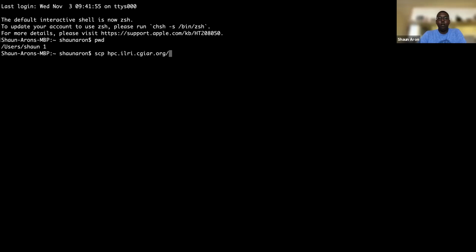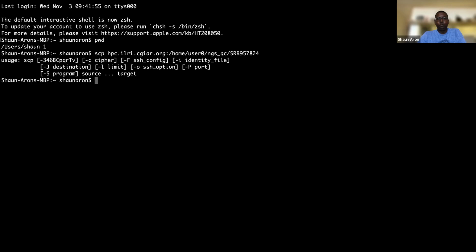Sorry. Okay, so that's the path to the files. And then I want to copy anything that ends with .html to where I currently am now.